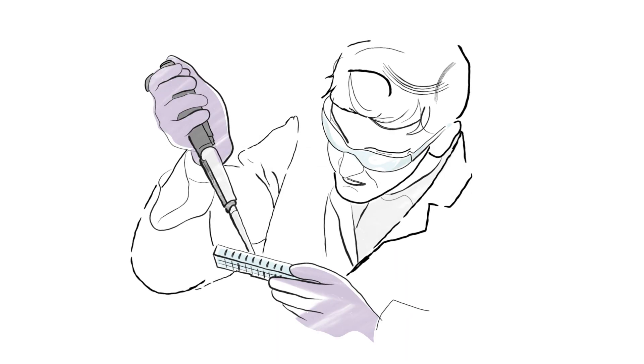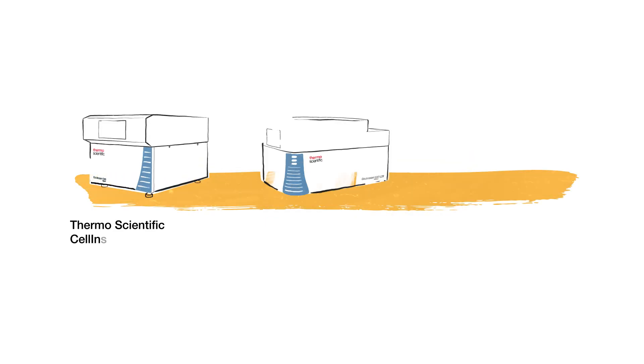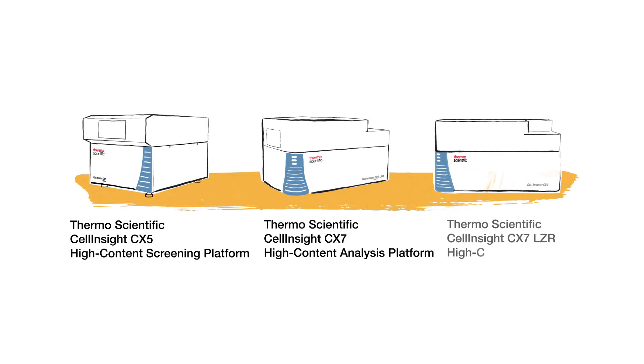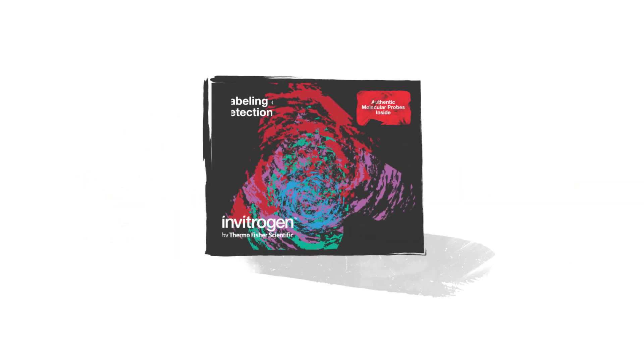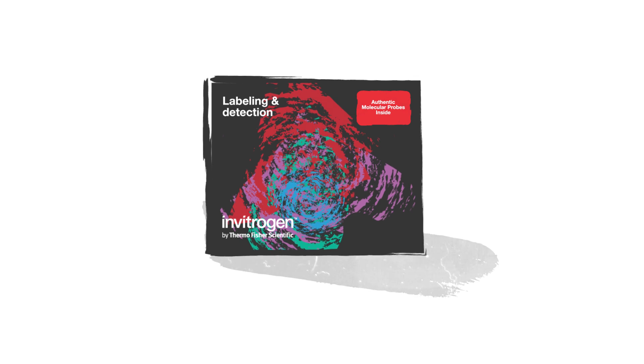Phototoxicity. Fluorescent stains and their required excitation wavelengths are typically detrimental to cell health. For reduced phototoxicity, consider using platforms capable of detecting fluorescent proteins such as GFP or RFP. Systems that have excitation capabilities at 740 nanometers and above are also recommended. Fluorescent proteins and higher excitation wavelengths tend to be less damaging to cells over long periods than wavelengths in the UV range.